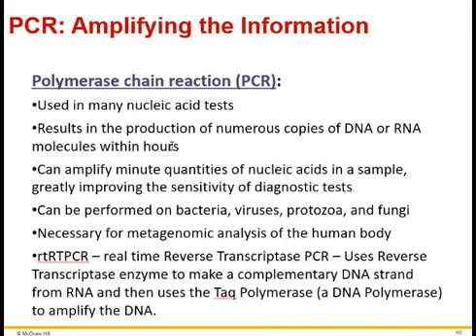And so it goes on an exponential copy method. So one copy makes two, and then those two copies become four, and four becomes eight. And then it goes at an exponential rate to where you have 30 copy cycles. You have 1 billion copies of this piece of DNA. And it can be used for a lot of different things. So it's our main test that we use in the laboratory anymore, because it's so easy and you can get these results within hours.